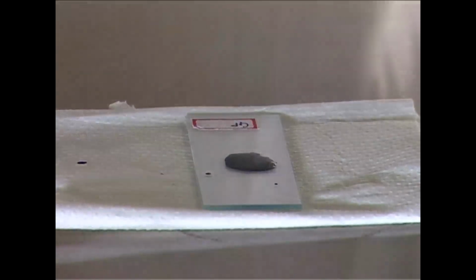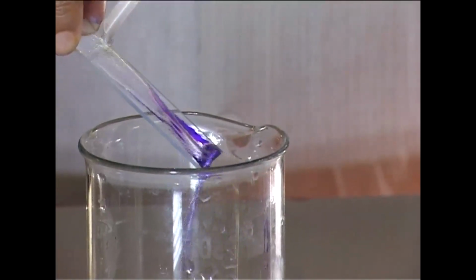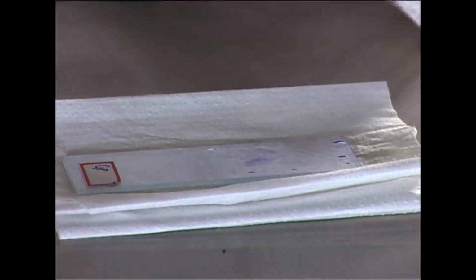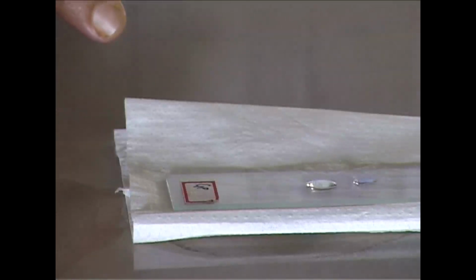for 30 seconds. The excess stain is washed off with distilled water. Then Gram's iodine solution is added to the slide and kept for 30 seconds.